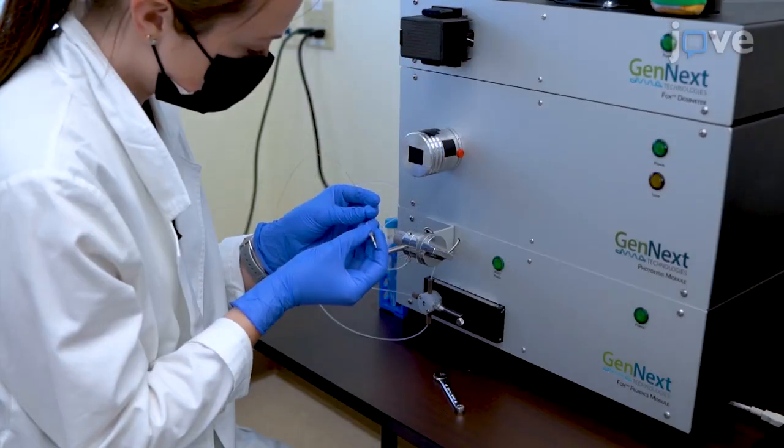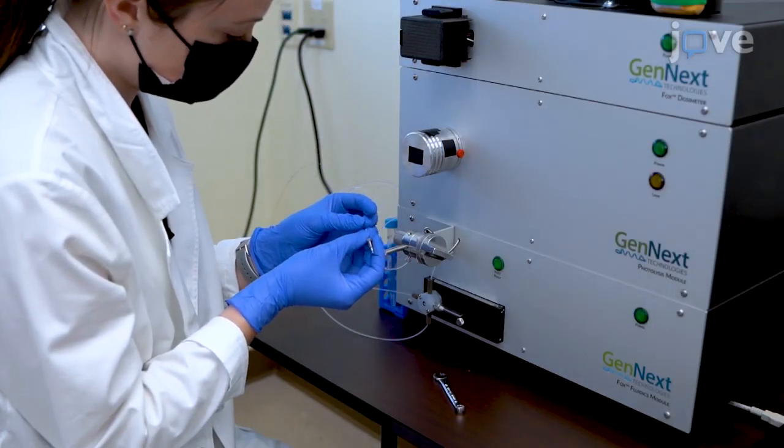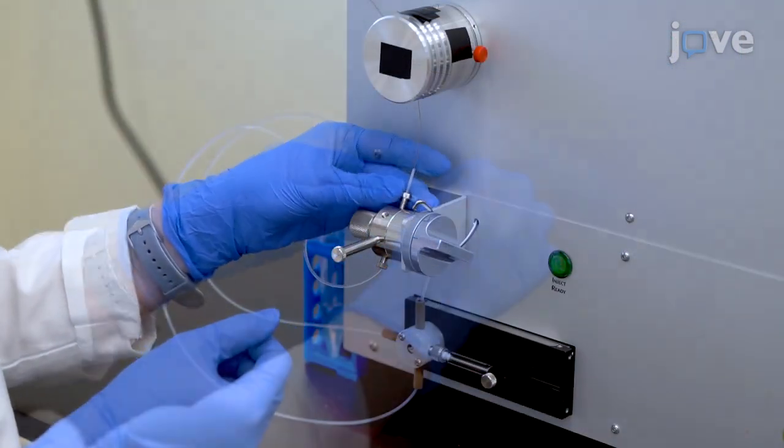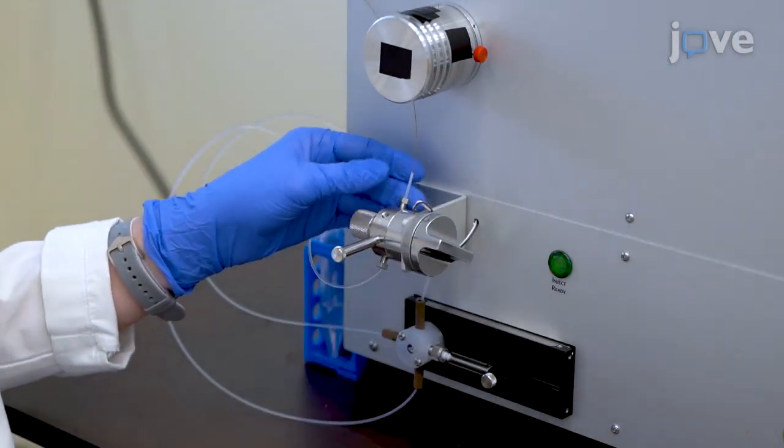Insert the lower end of the capillary just beyond the conical end of a nut and ferrule. Add the capillary to port 5, tightening just beyond finger tight with a wrench.